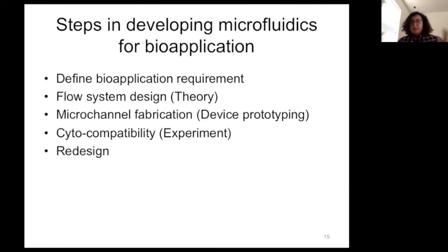And then after you design your microfluidic channel, because you don't want to really do trial and error, right? You don't have the resources, you don't have the time, so you have to really build a really fit microfluidic channel for your bioapplication, and then at the end you can redesign it if it doesn't work, or you want to improve it.